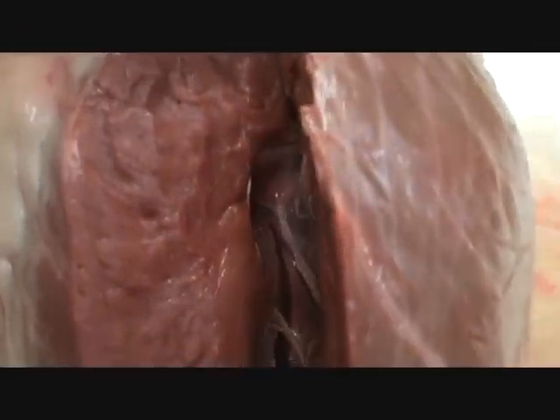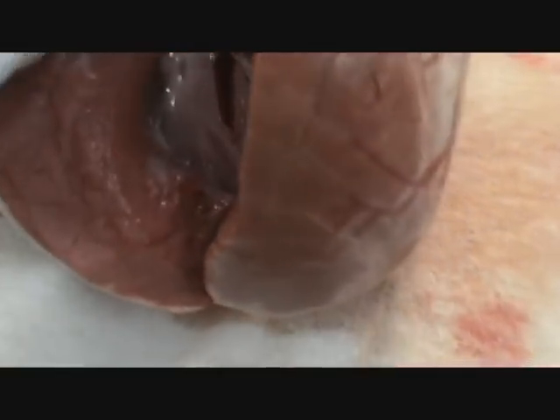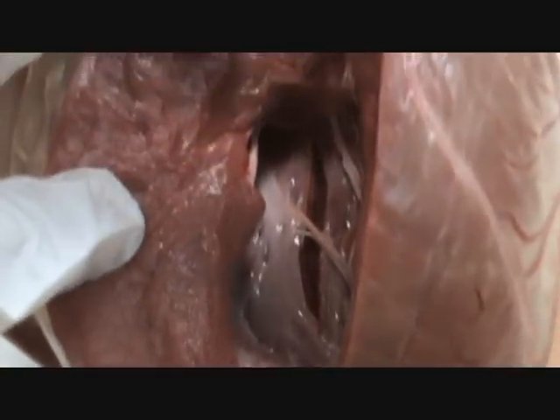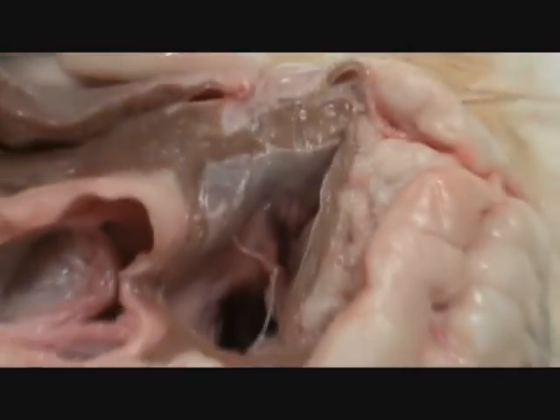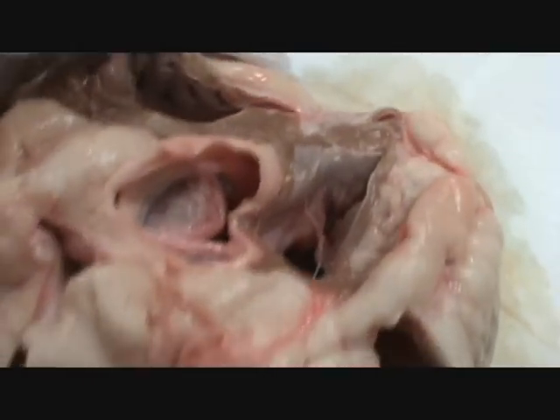It's got strings attached. We call these strings the chordae tendineae. Look at this nice papillary muscle. Watch this — the muscle contracts, pull the string. I'm going to show all of you guys. Papillary muscle contracts, pulls on the tendon — we'll connect that to the valve.